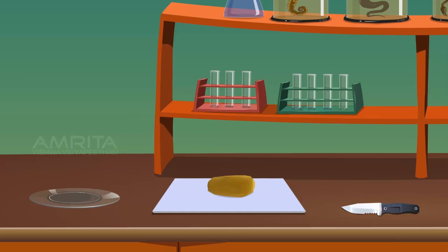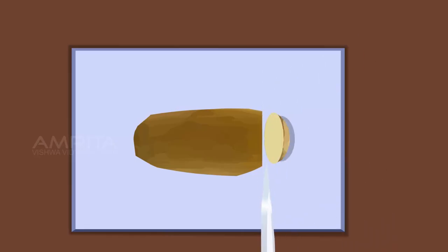Procedure. Take a potato from the watch glass and place it on the tile. Take a knife and cut both ends of the potato to make it flat.